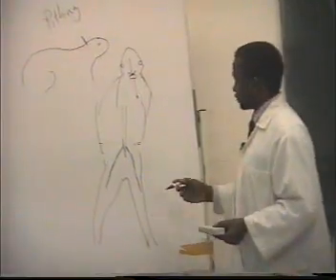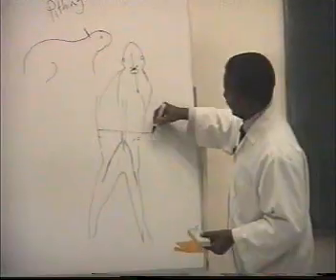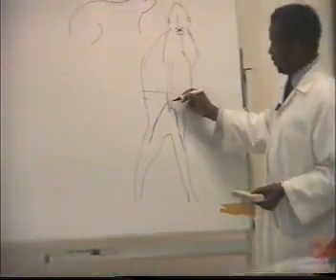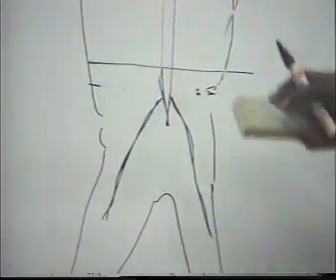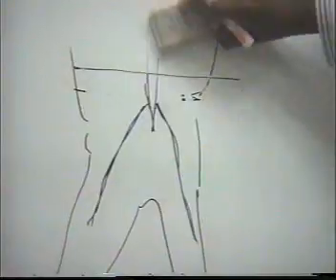Then we cut the vertebral column at this level, because we left 2 or 3 vertebrae below the cut, and we always have to keep our preparation moist in this Ringer solution.